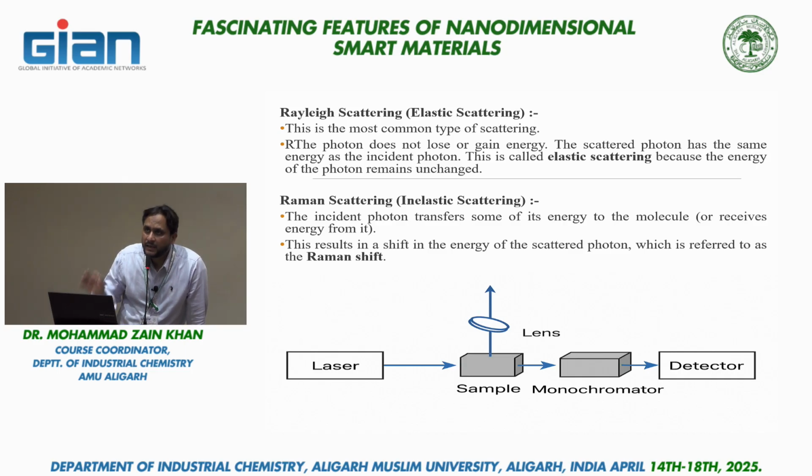And in any of the spectroscopic techniques, or I should say in all the spectroscopic techniques, there are certain components which are an integral part of that machine, which must play some important role, without which it is not possible to complete the study. Out of those components, the two major components are the light source and, what is the next? The detector. Although we have a monochromator in all those spectroscopic techniques, and what does a monochromator consist of?